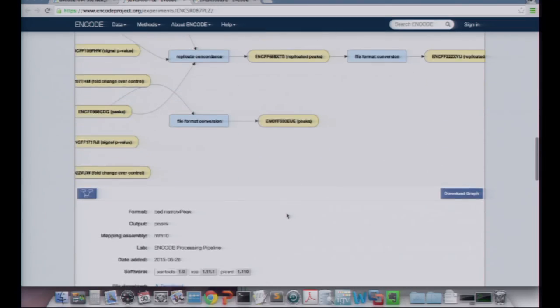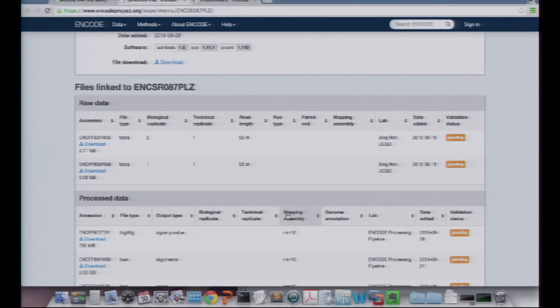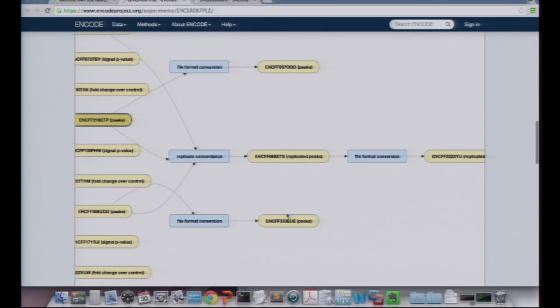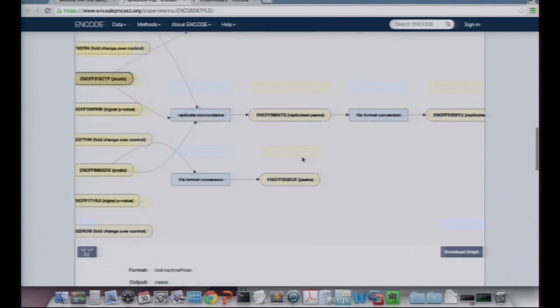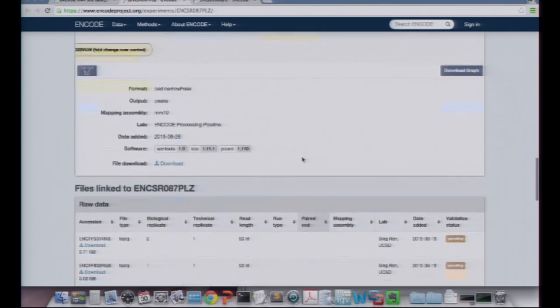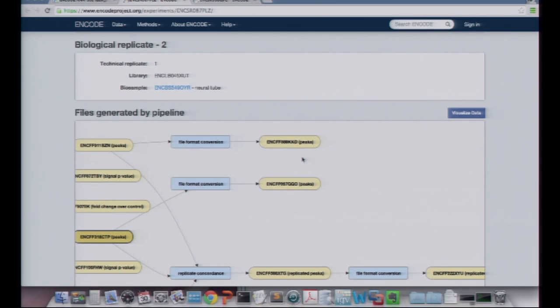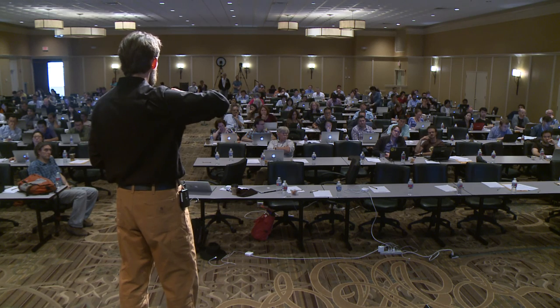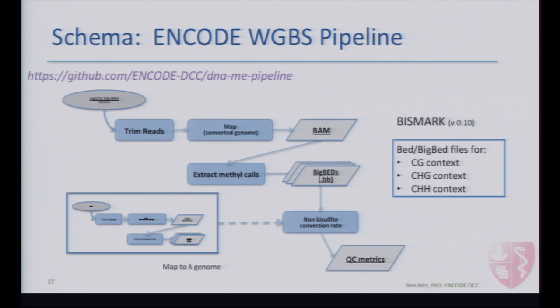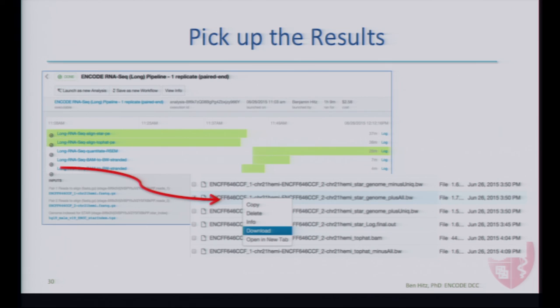I've shown you the graph of file relationships, and the only other thing I wanted to show you is that each of these files is available through the graph as well as in a list of files at the bottom of the experiment page on the portal. What I want to make clear is that we spent a lot of time talking about the platform where we actually run the experiments on the cloud, but all of the results of those runs are distributed through the portal. The results are accessioned and distributed through the ENCODE portal.